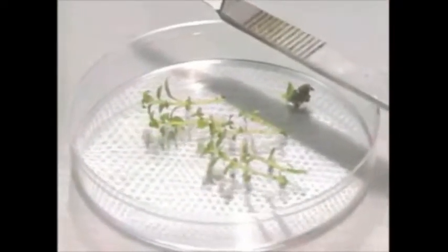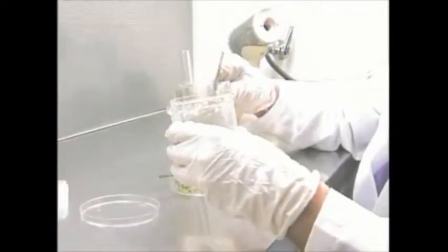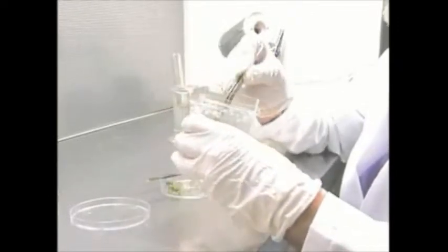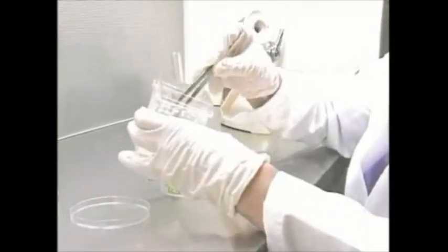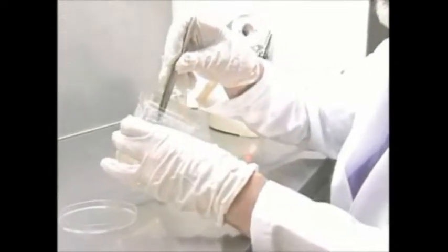There are 5, so that's a 5 or 6-fold multiplication rate. Then we can take the individual shoots and transfer them to fresh nutrient media, once again containing the sugars, mineral nutrients, and the hormone cytokinin. Take any one of the shoots and place it into the culture vessel. We can put about 9 shoots into a vessel like this.